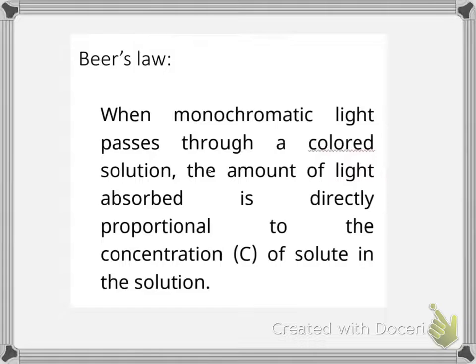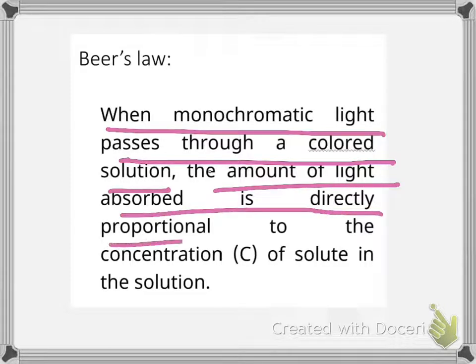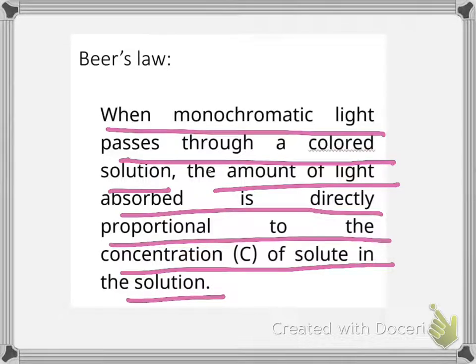Beer's law states that when a monochromatic light passes through a colored solution, the amount of light absorbed is directly proportional to the concentration of the solute in the solution.